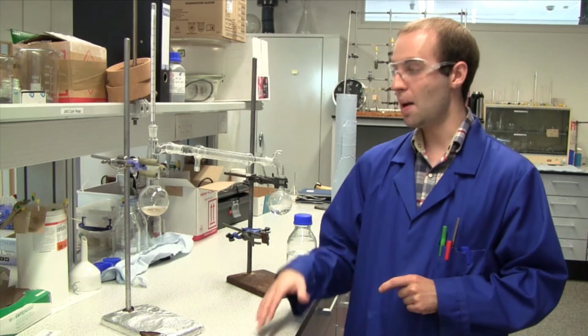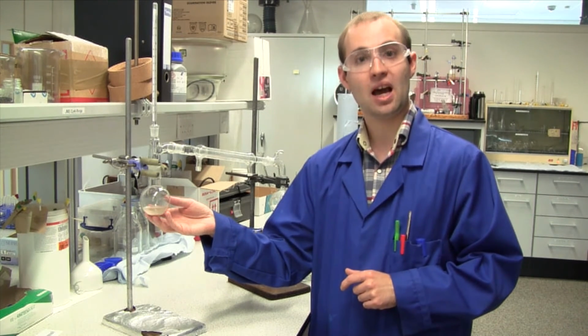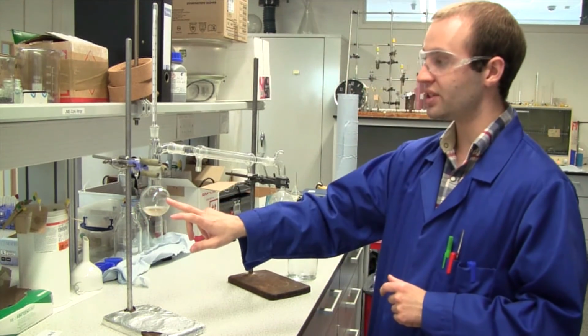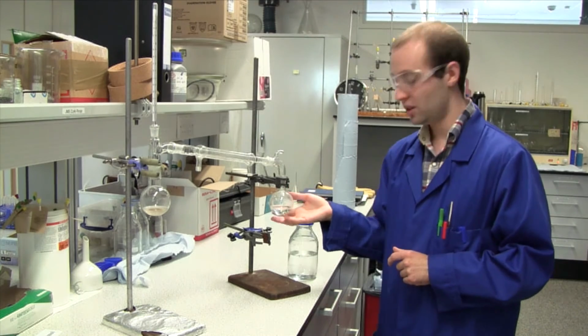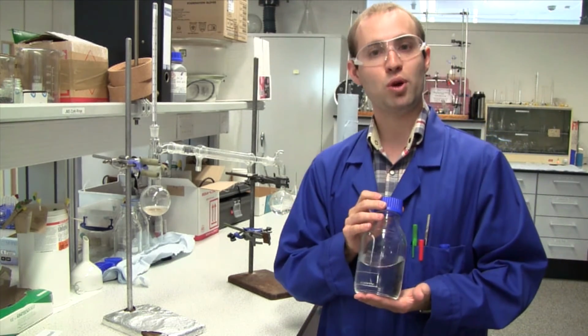Now we have a mixture of biomass, some sugars, ethanol, and the medium that the yeast is in, as well as some buffer. To get our ethanol from the solution, we have to do a distillation. We can heat on the one side, cool down by our condenser to produce the clear liquid, which is ethanol. After that's complete, there you have your bioethanol from your plant biomass.